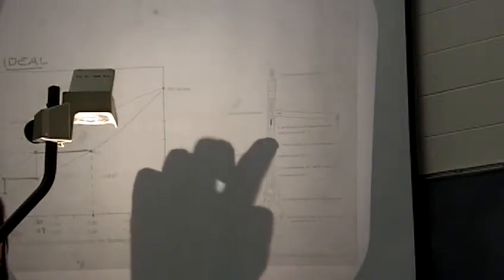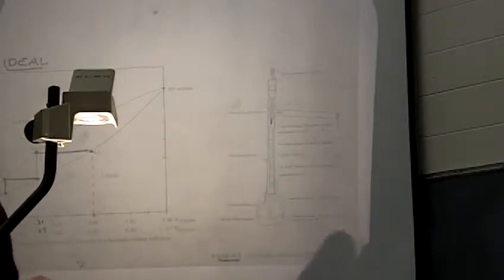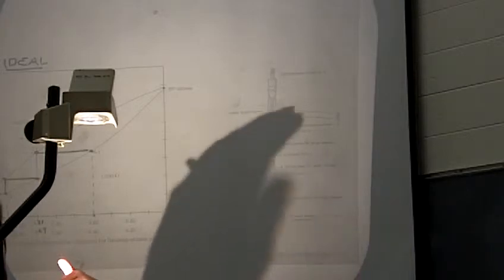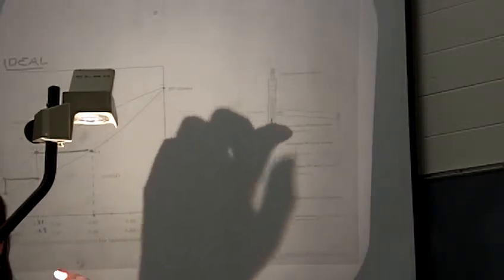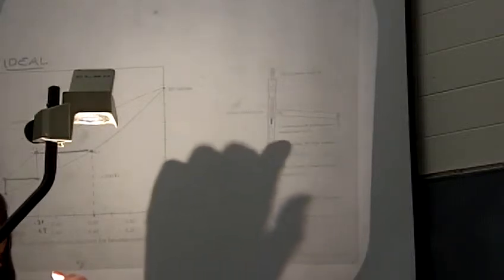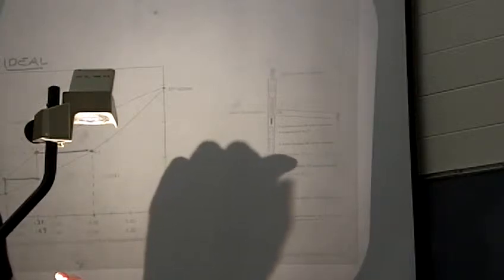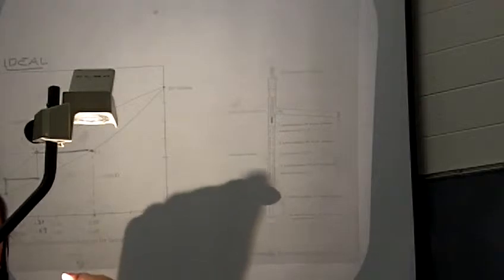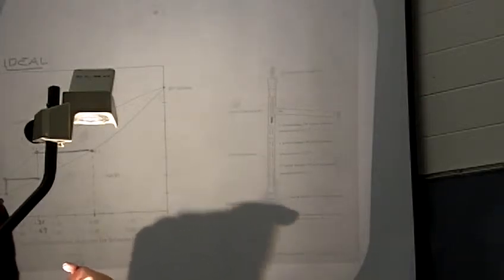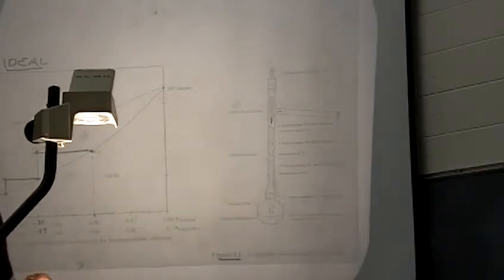So we just have 4 sets of distillations here, and as we go up, we purify that hexane more and more. So as you climb a fractionating column, the boiling point of that liquid is going to decrease as you go up because you're purifying more of the lower boiling component. Okay? And then once you get rid of the lower boiling component, then you're going to purify the next highest boiling component. Okay? So does everyone see how that works?